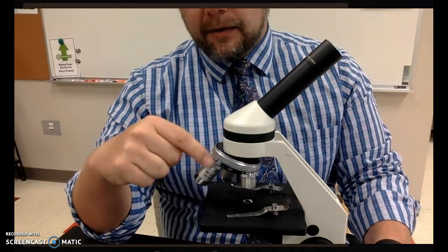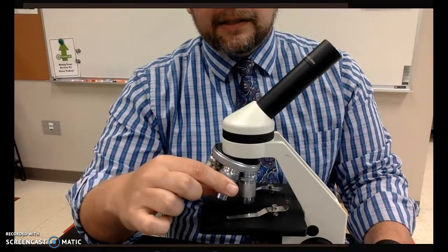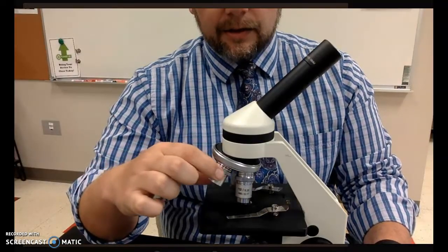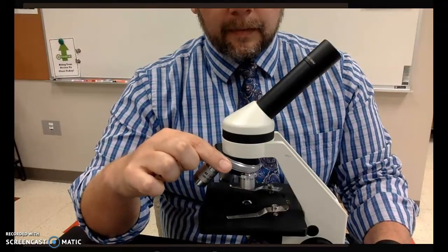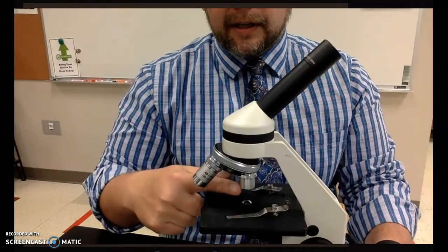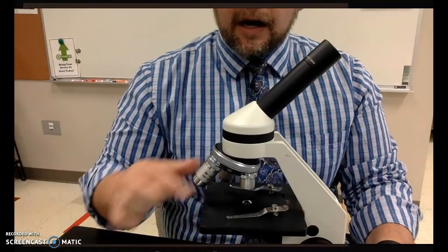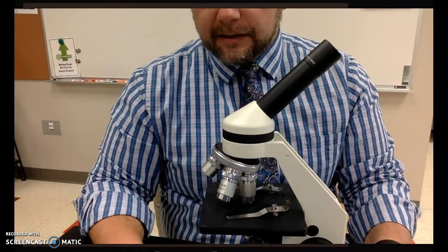Down here, we have what is called the revolving nose piece. And the revolving nose piece does exactly what it says, revolves. Attached to the revolving nose piece are what we call the objective lenses. We, on our microscopes, have 3 objective lenses.